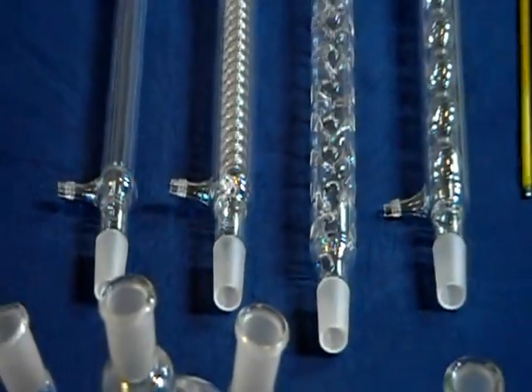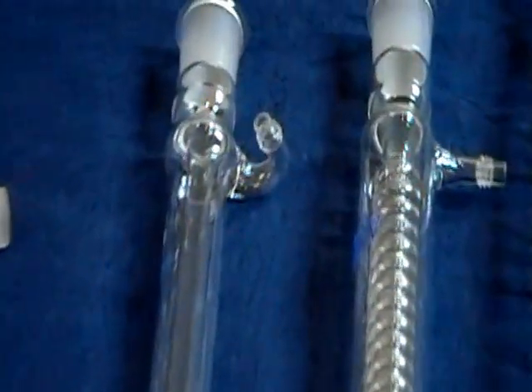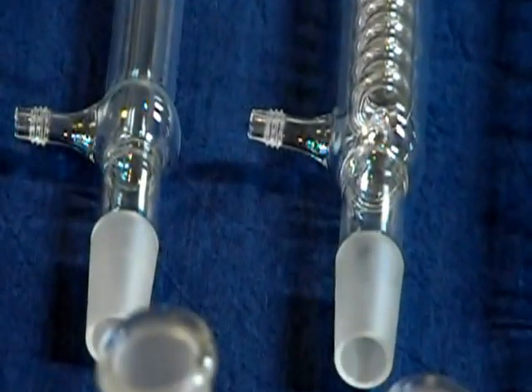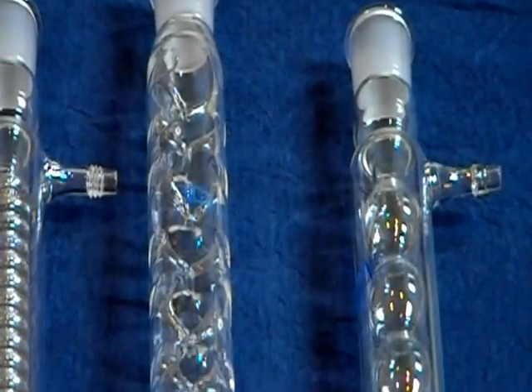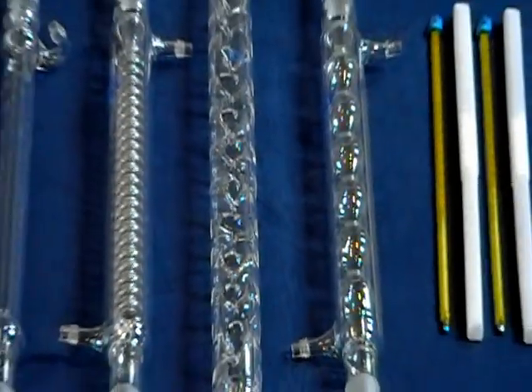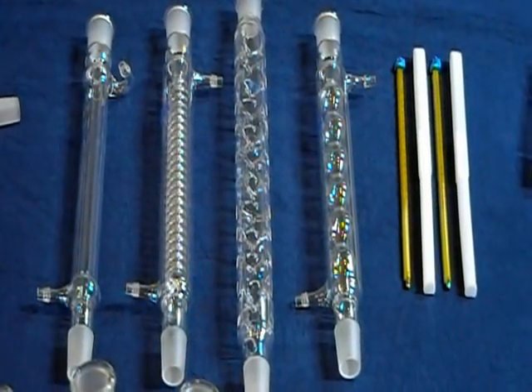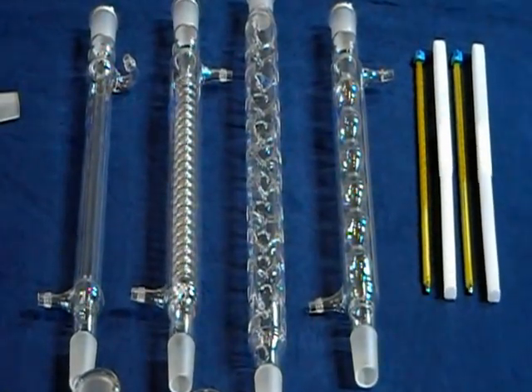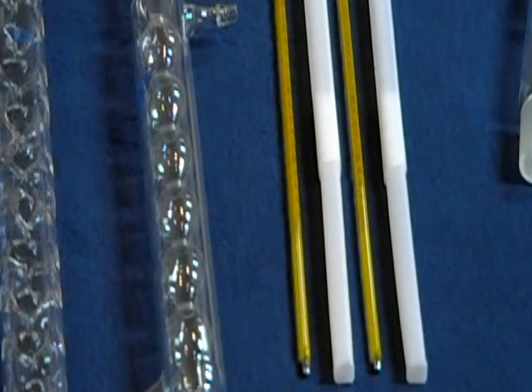This kit also comes with four styles of condensers: a 300mm West and Graham condenser, 24/40, and a 400mm Vigreux and 300mm Allihn condenser, 24/40. The Vigreux 400mm is 200mm greater in effective length than others offered with this kit. Typically a 200mm is offered with these types of kits; we offer a 400mm for greater distillation efficiency.